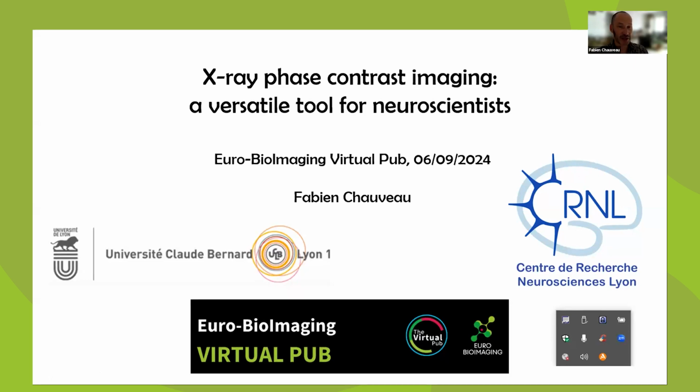It's really a great hub and a great place, and I see a lot of exciting presentations already on the YouTube channel. So today I'm going to try to present to you an X-ray technique which enables phase contrast imaging, and I will try to convince you that with that technique we can do a kind of virtual histology.